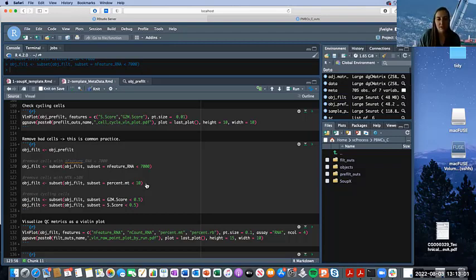We don't necessarily want dying cells in our data set if we're trying to look at what a healthy, typical cell from this sample would be like. So we want to get rid of some that might have been very stressed or dying during the library preparation process, during that chip process of 10x, that very first day. All right.